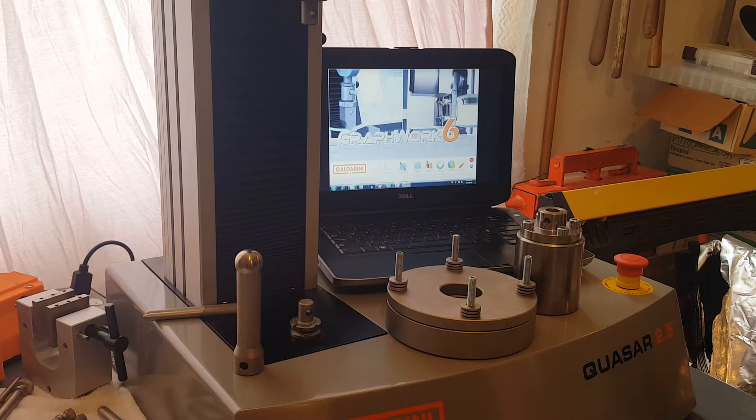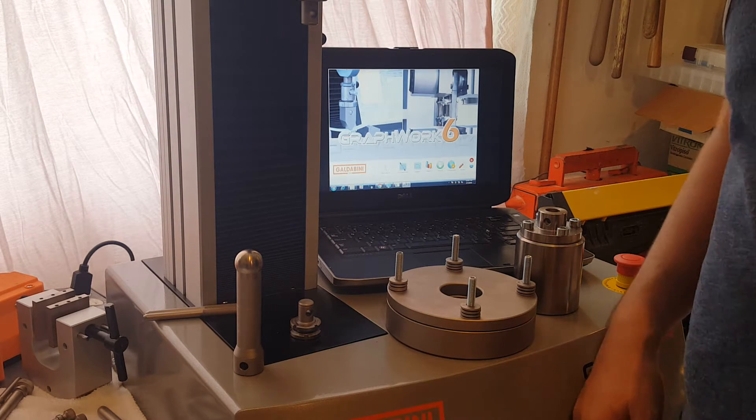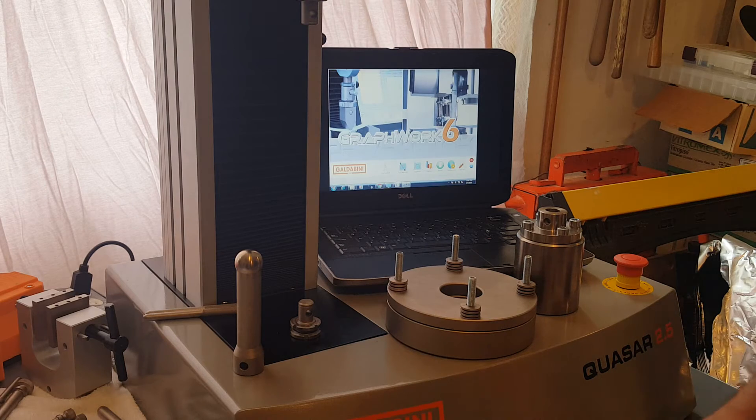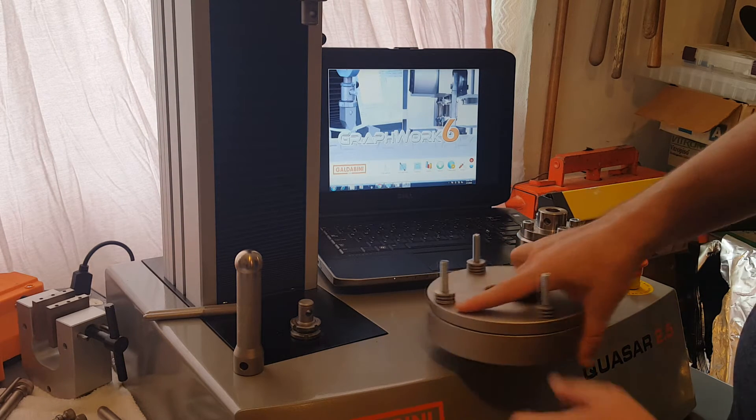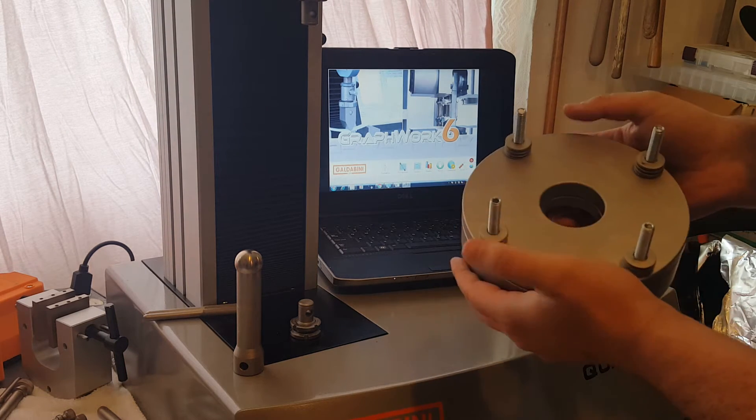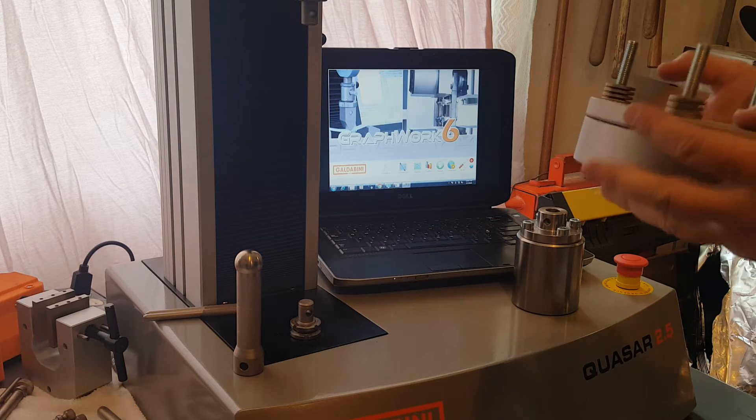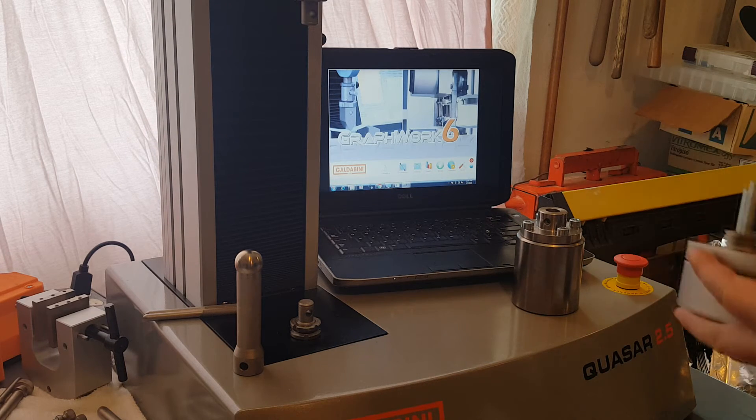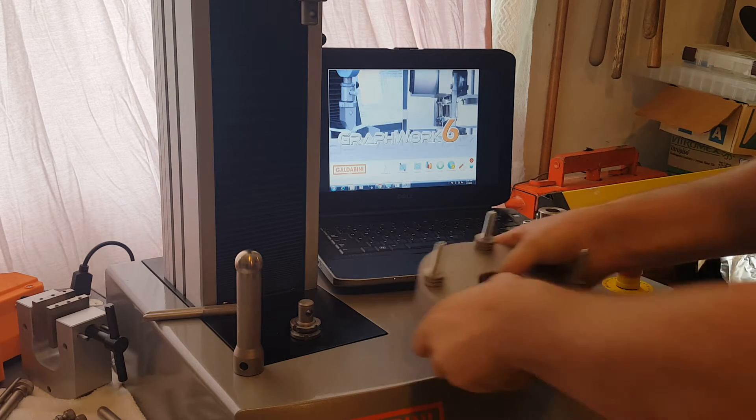Hello. Today we are going to demonstrate our ASTM D3787 puncture fixture for textile testing. This is also the same fixture that's used for ASTM D6797.